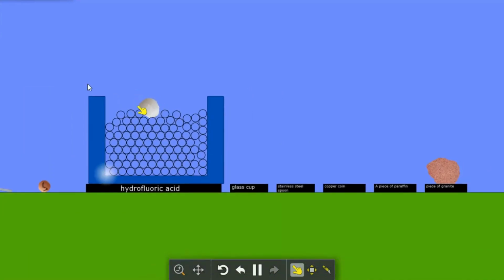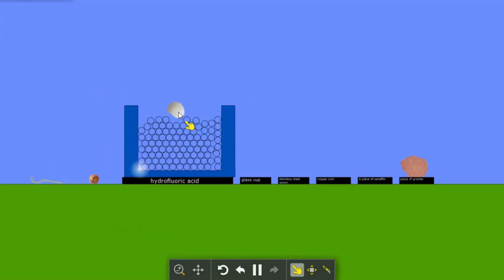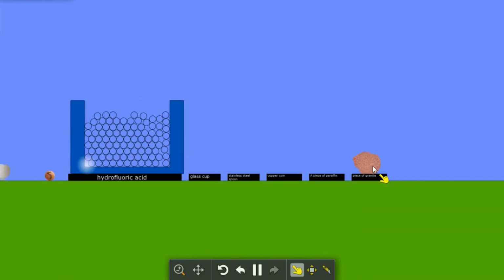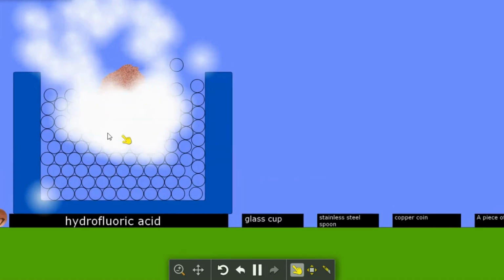Paraffin does not react with hydrofluoric acid because it does not contain oxygen atoms that can be replaced by fluorine atoms. Paraffin simply floats on the surface of the acid without changing its state. But granite dissolves in hydrofluoric acid because it contains quartz, which is a silicate. As we already know, hydrofluoric acid destroys silicates, forming silicon fluoride and water. The reaction follows the same equation as with glass, SiO2 plus 4HF, SiF4 plus 2H2O. If we wait a while, we will see that the granite will completely disappear in hydrofluoric acid.